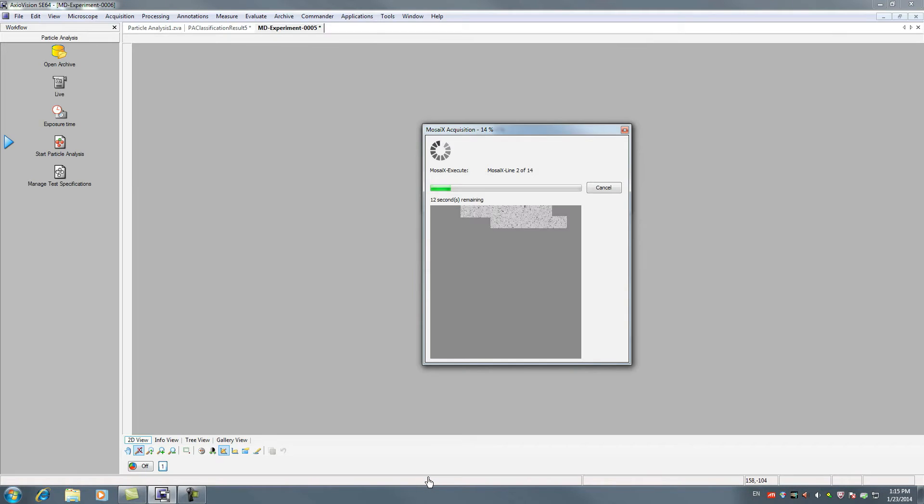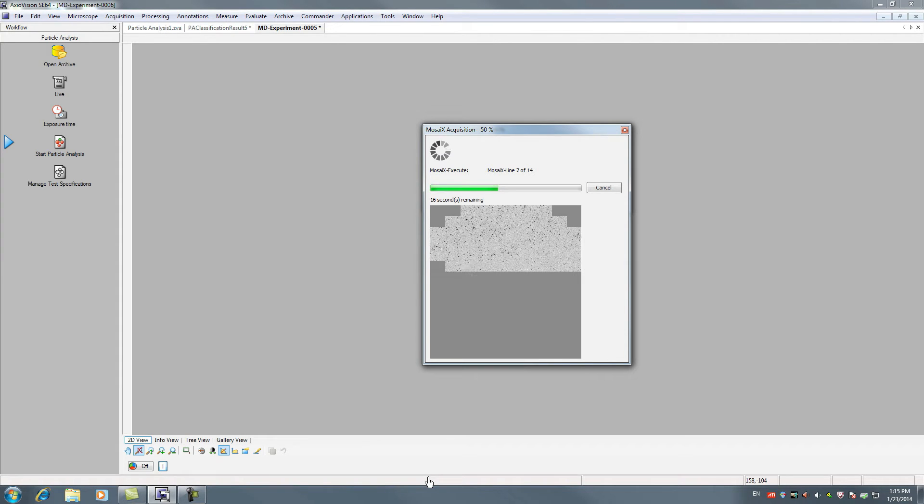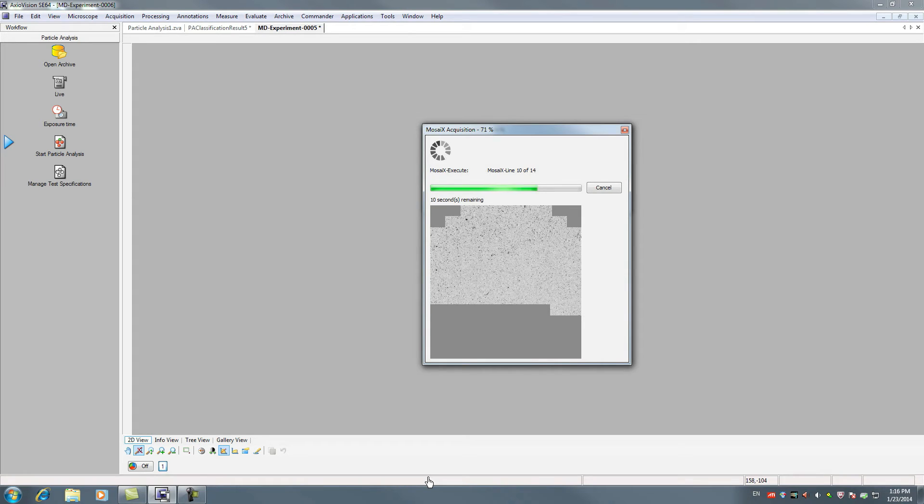Following the bright field image acquisition, you will automatically receive your results from the light microscope analysis. This supports ISO 16232 and VDA 19.